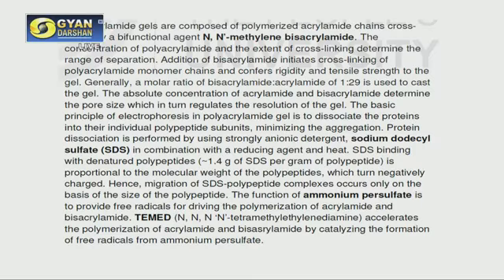Then what you add is ammonium persulfate, APS we call it in short, that provides free radicals for driving the polymerization of acrylamide and bisacrylamide. And finally you have to add TEMED, because TEMED accelerates the polymerization. This cross-linking or polymerization is facilitated by TEMED, but mind that you should add TEMED at the very end, because once you add TEMED, immediately the cross-linking starts. So APS and TEMED should be added at the end, and immediately you have to pour the gel.